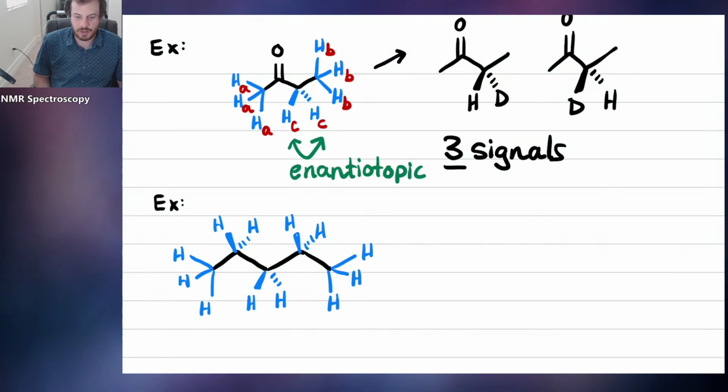Okay. Now, because of symmetry, the methyl groups on the left and right are equivalent with each other. It's a completely symmetric molecule, so we need to build from the outside in. And so we can see that, of course, within themselves, the methyl groups are going to be the same. But because the molecule is totally symmetric on the left and the right, the chemical environment is no different on the left side of the molecule than it is on the right side. So these are all A's as well.